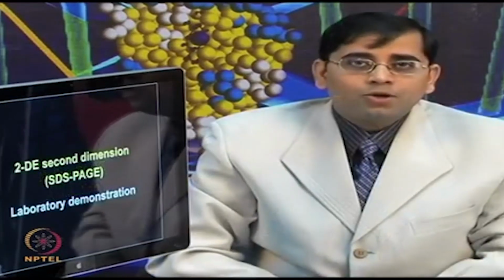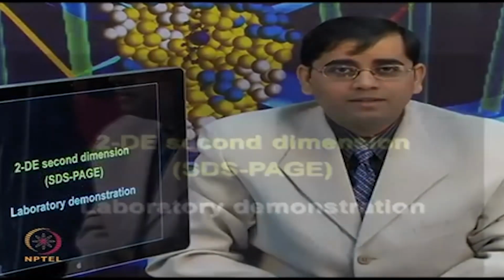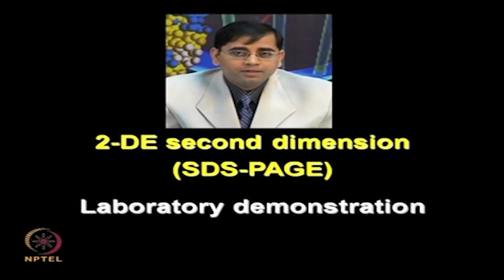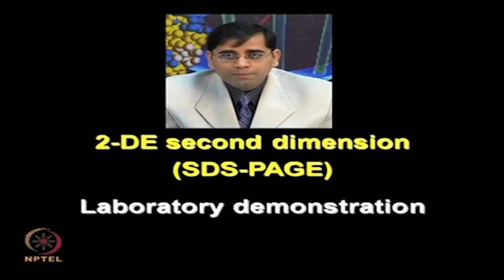After watching this animation, I hope you are able to understand how to perform native polyacrylamide gel electrophoresis, and these concepts can be applied for using the 2DE as well. So, now you are familiar with how you can apply both SDS PAGE and blue native PAGE, and you can obtain unique information about subunit composition and different types of isoforms from different proteins, and you need to apply both the techniques together. Now, you are also familiar with how to determine the molecular weight of an unknown protein.